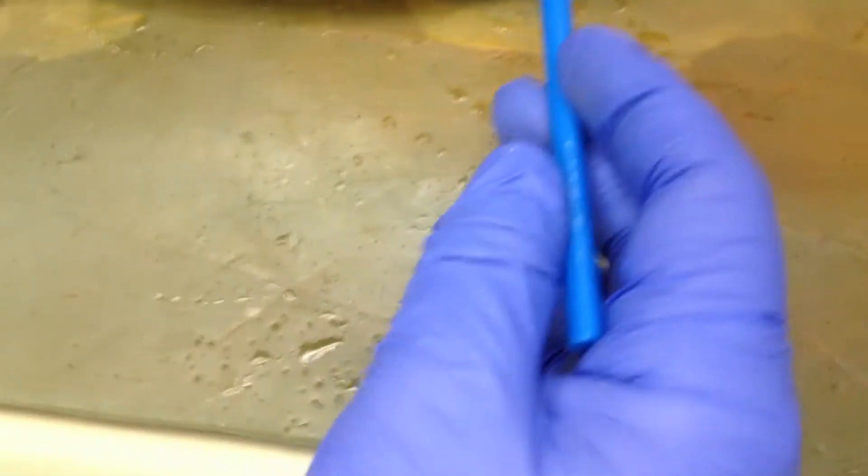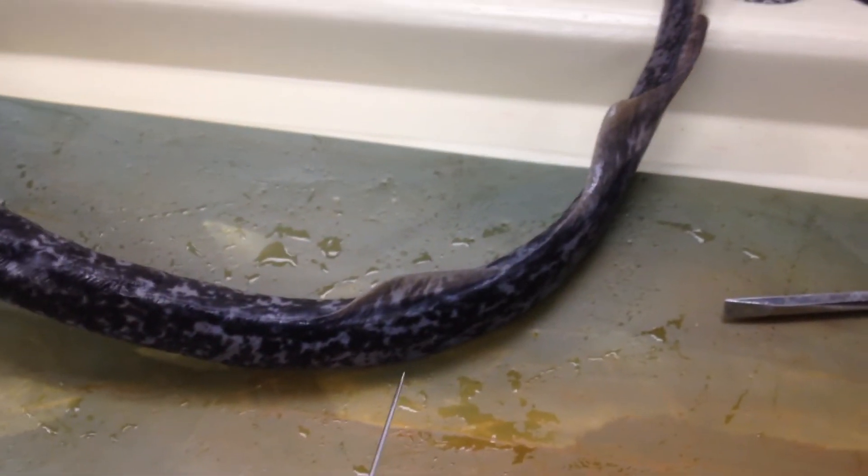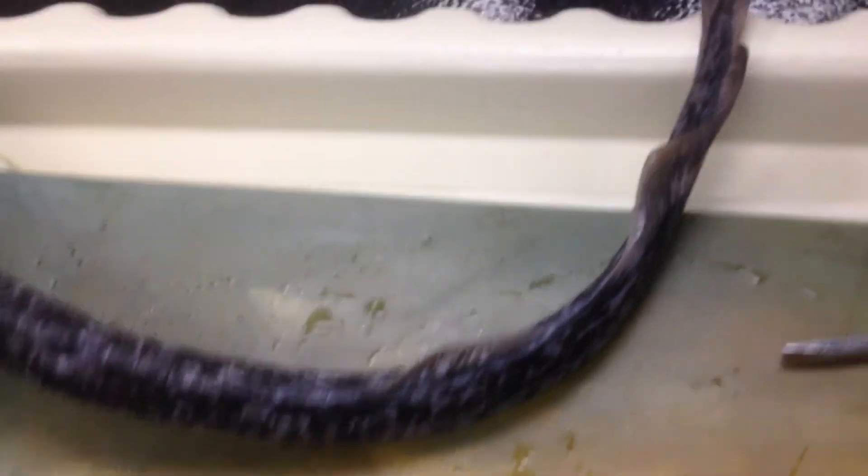Anything else you want to get? The anterior dorsal fin and the posterior dorsal fin — anterior to the front, posterior to the back. And the caudal fin.